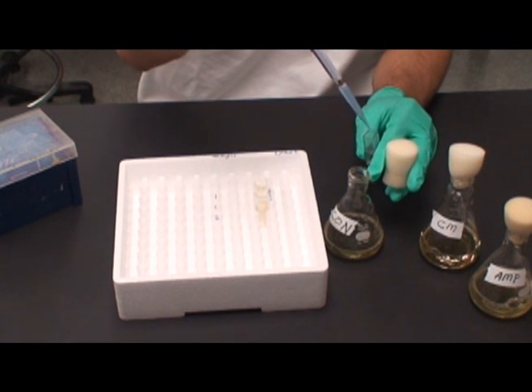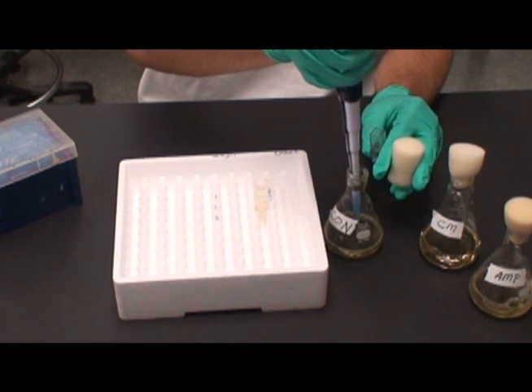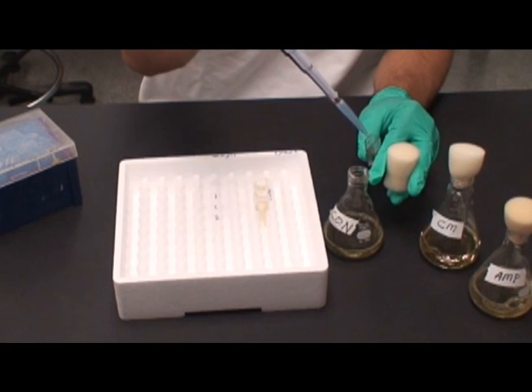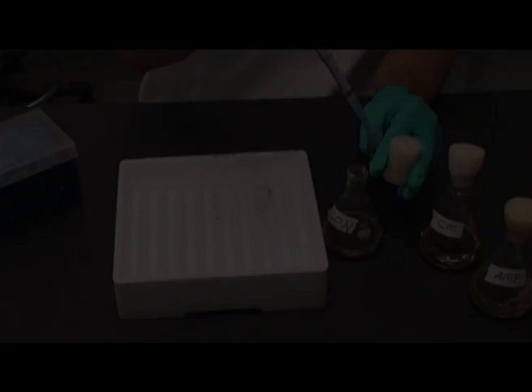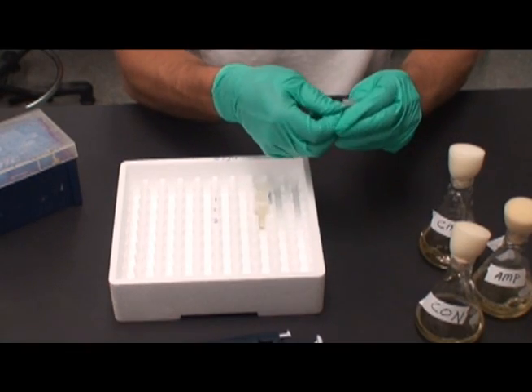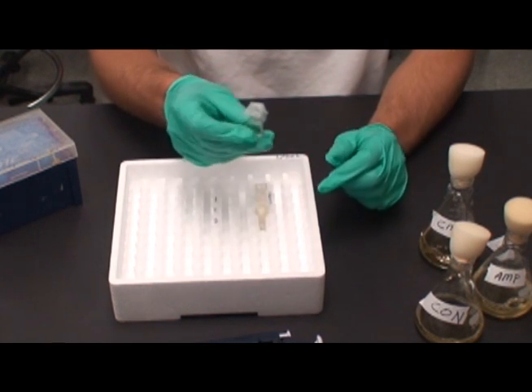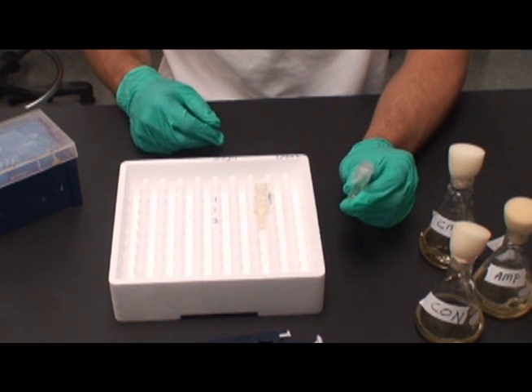At various times, the flasks will have to be removed from the shaker such that 3 milliliters of the cultures can be transferred to a cuvette and parafilm applied such that the OD of the culture be determined using the spectrophotometer. Following the reading, place the cuvettes in the labeled tray.